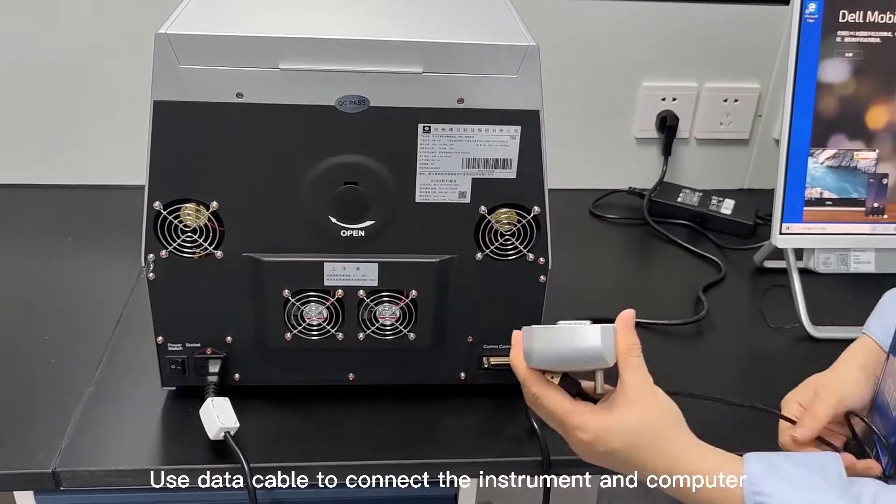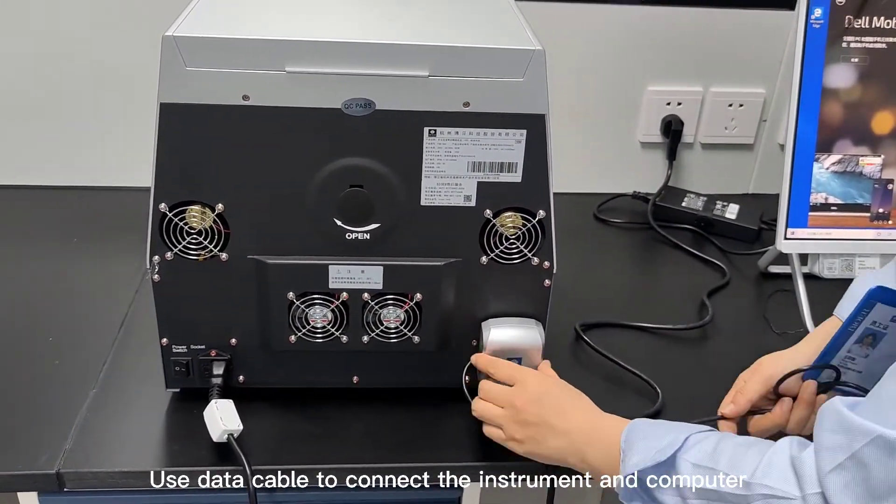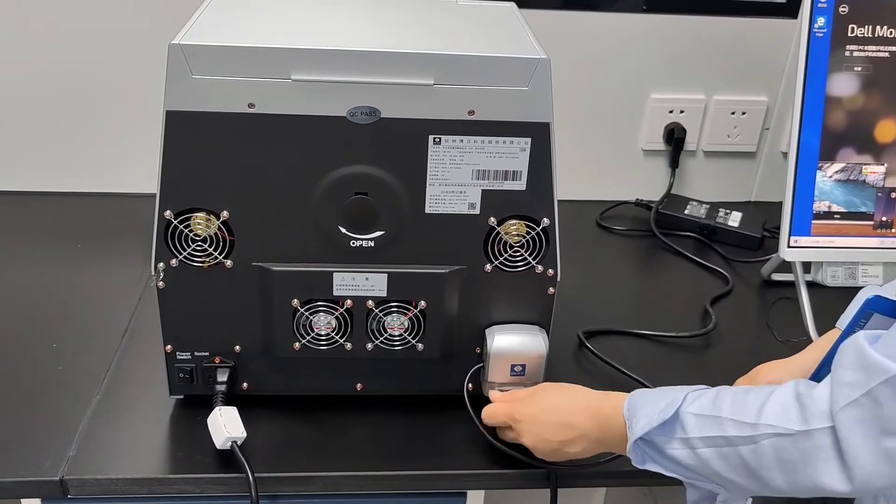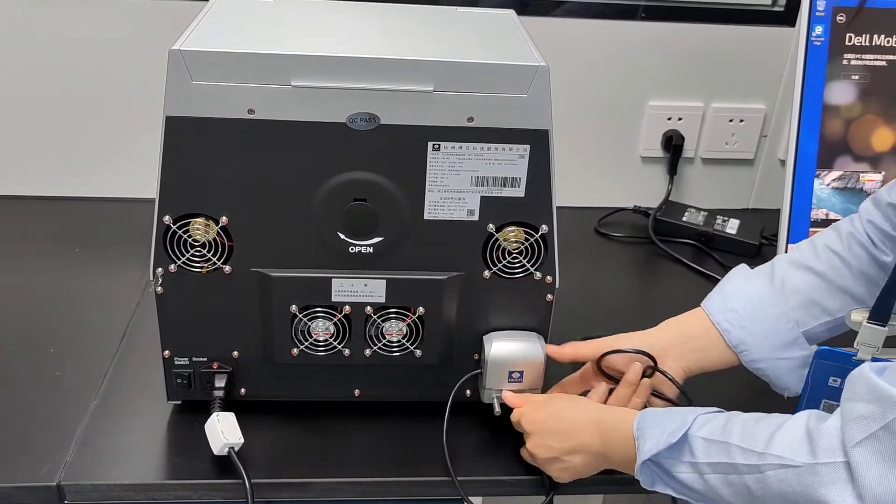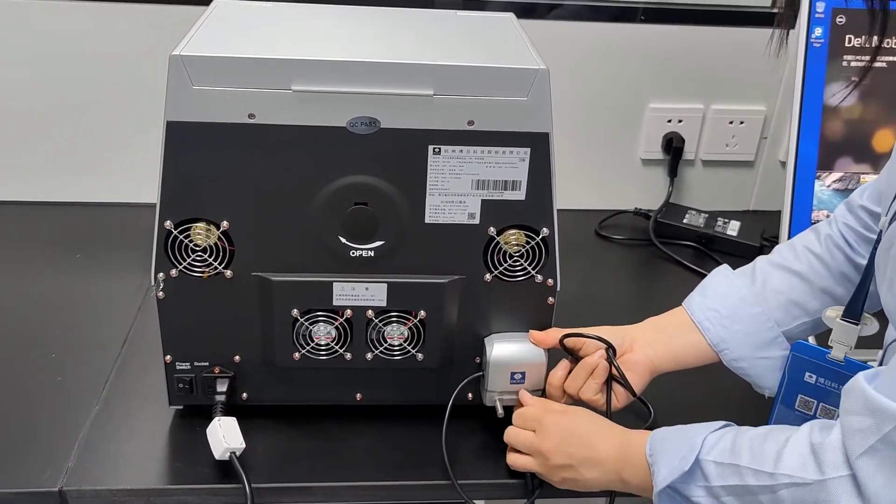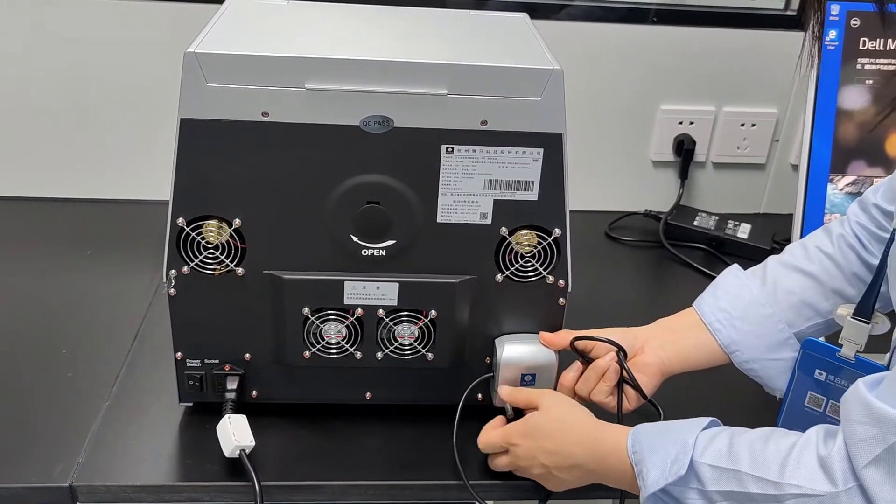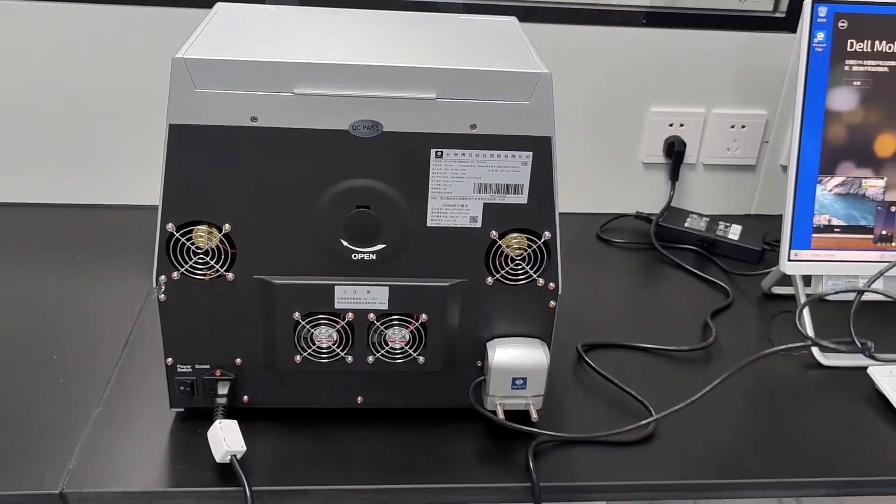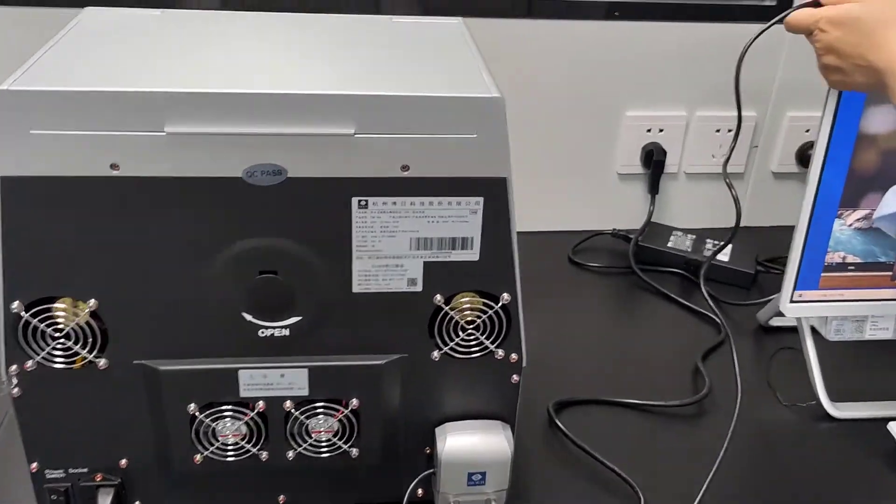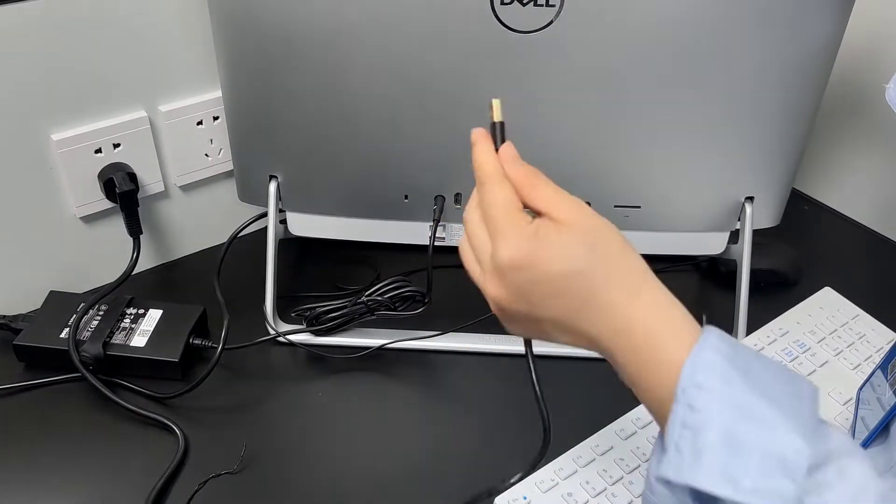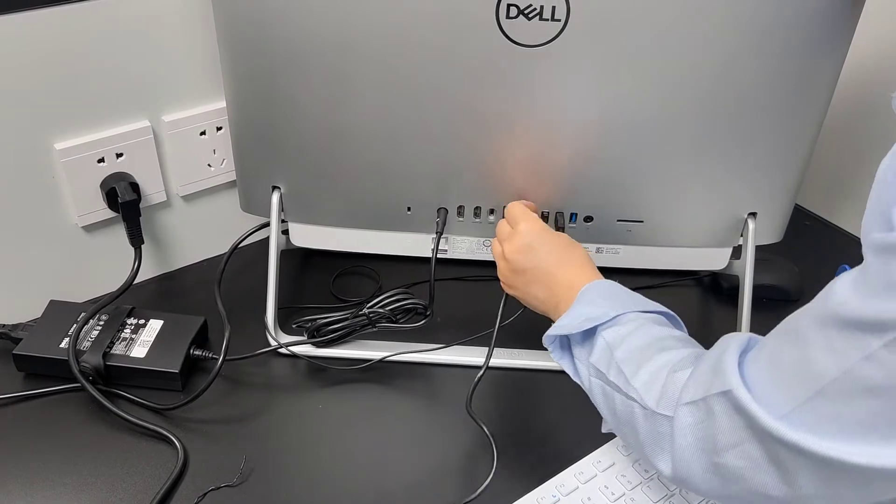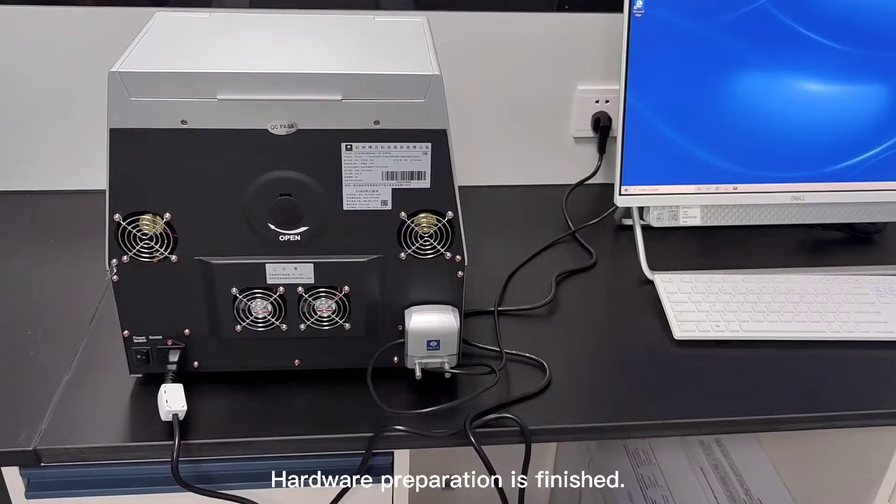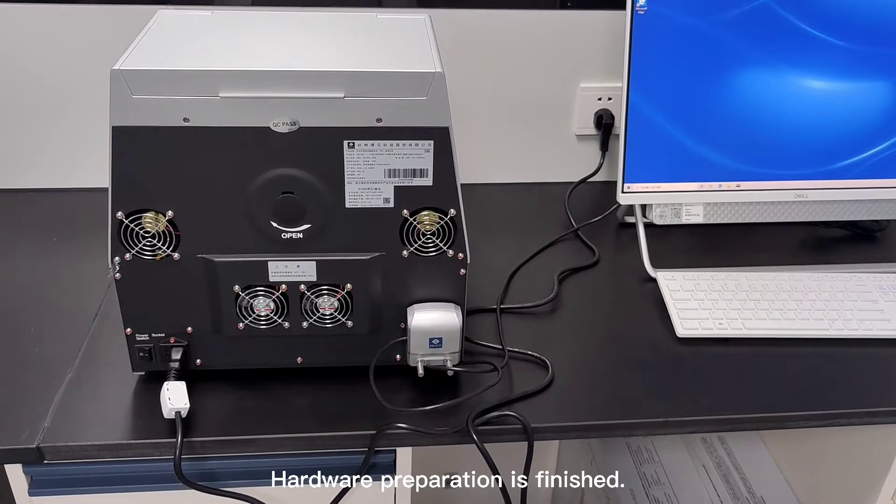Use data cable to connect the instrument and computer. Hardware preparation is finished.